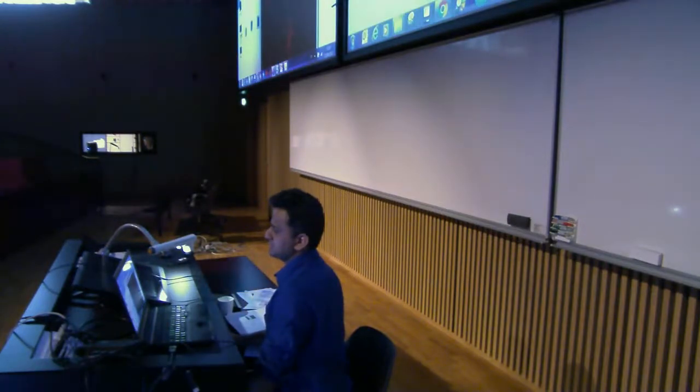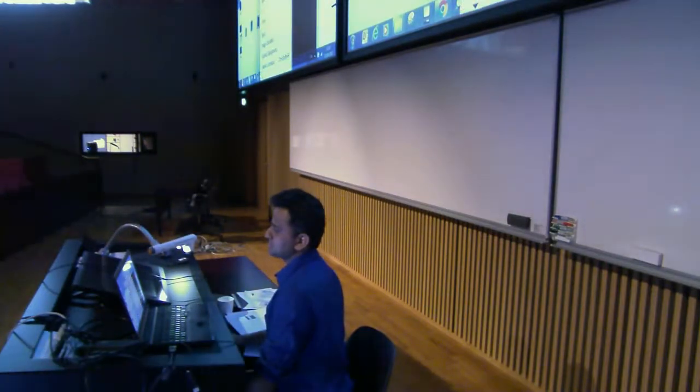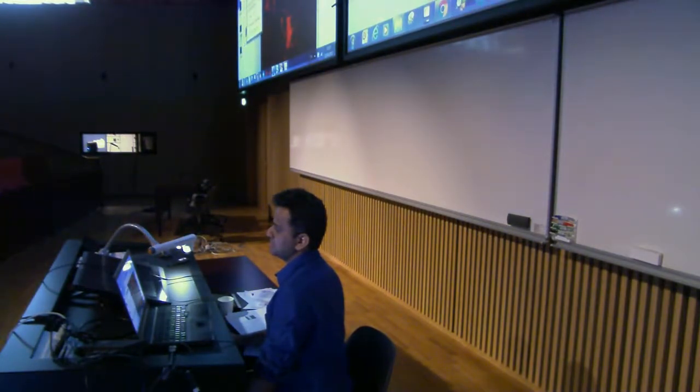So let's say this is my image, go to process, image, adjust, and say threshold. Now thresholding, as everyone knows, what I'm telling now to the computer is that I want all the pixels whose intensities are more than 739 until 4095. You can change this one also. See what's changing here?